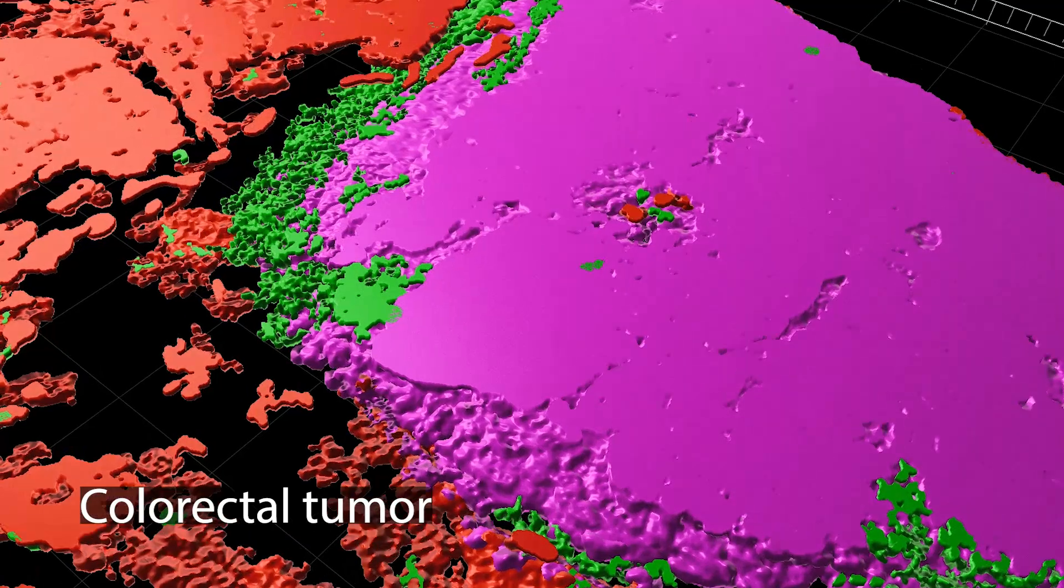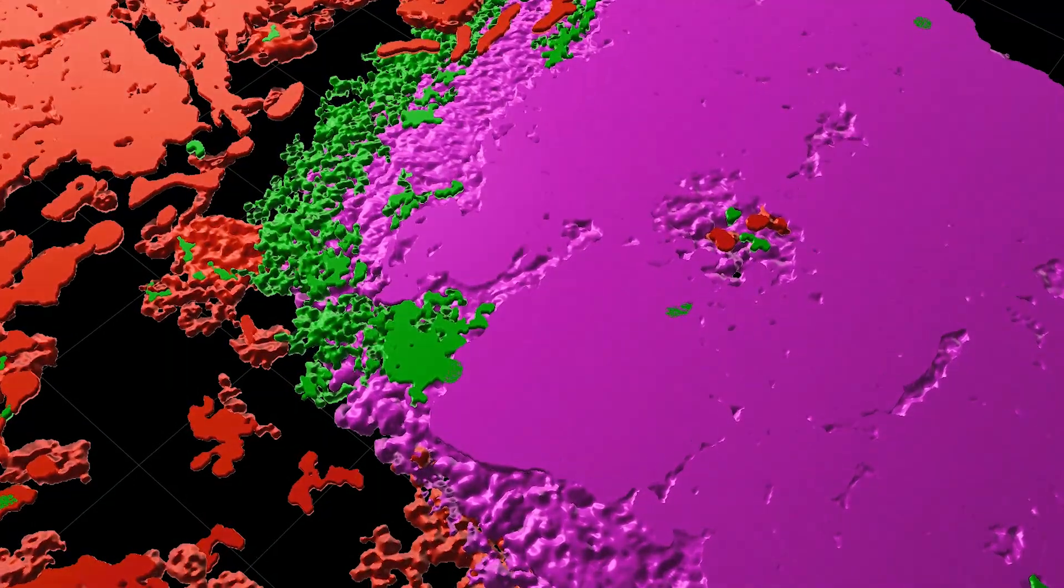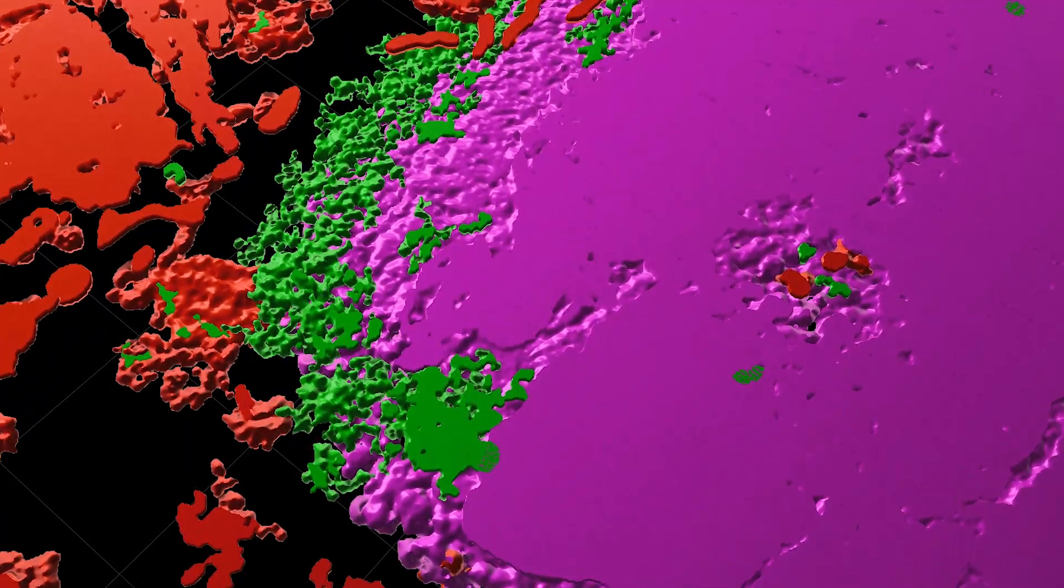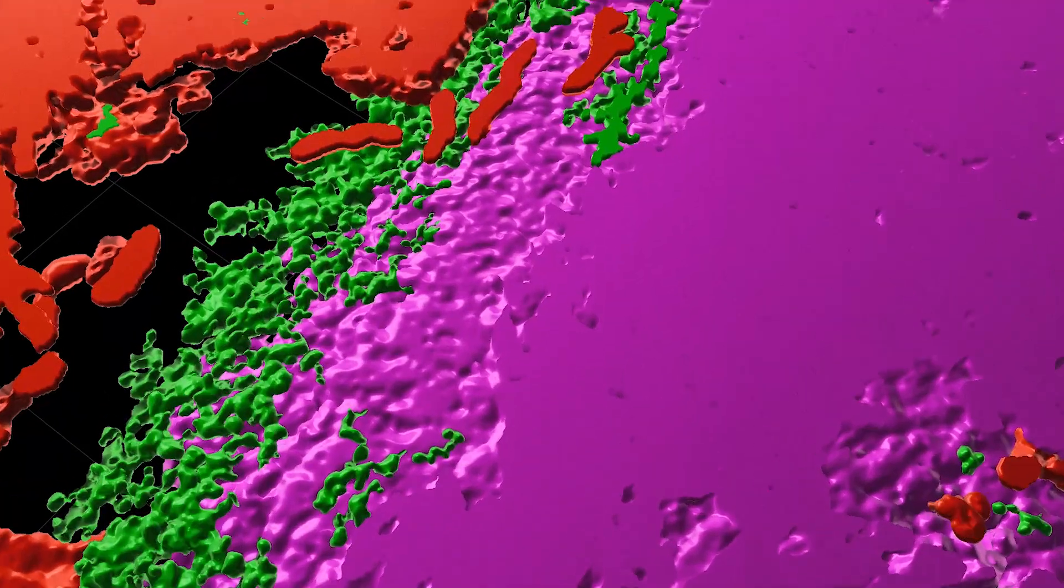Here, a colorectal tumor has spread to the liver. Red cancer cells break through a barrier of green immune cells and invade the healthy pink liver.